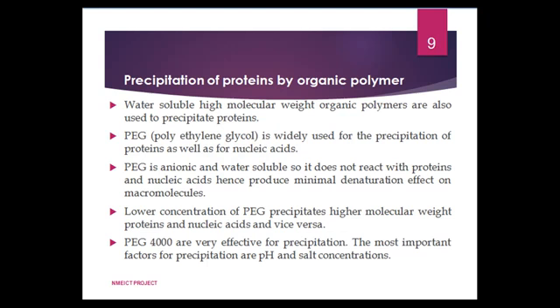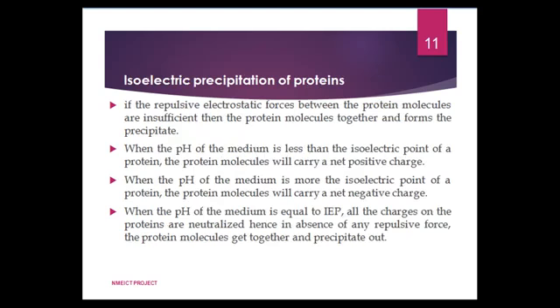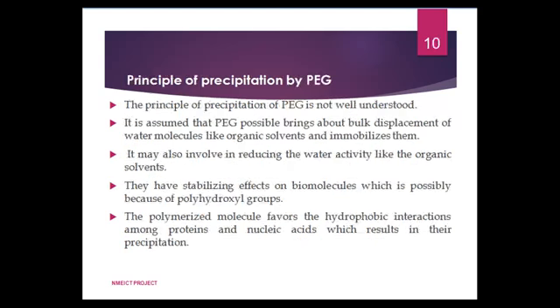Much lower concentration of PEG is enough when proteins are at their isoelectric points. Salt concentration also influences the precipitation by PEG. The principle of precipitation by PEG is not well understood.